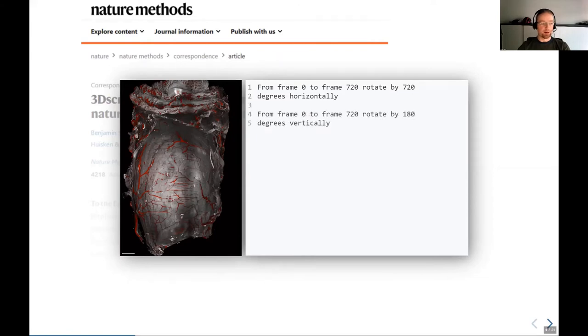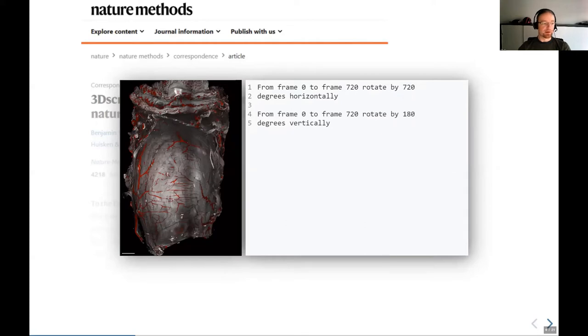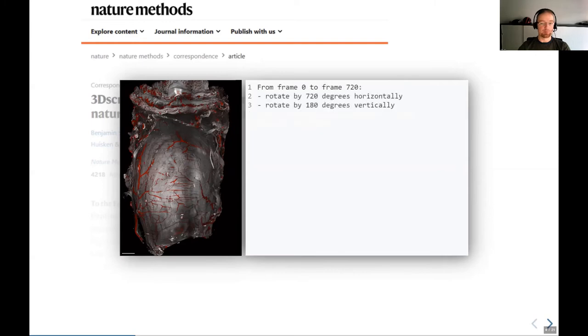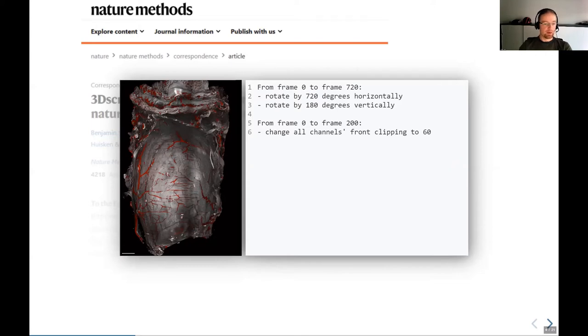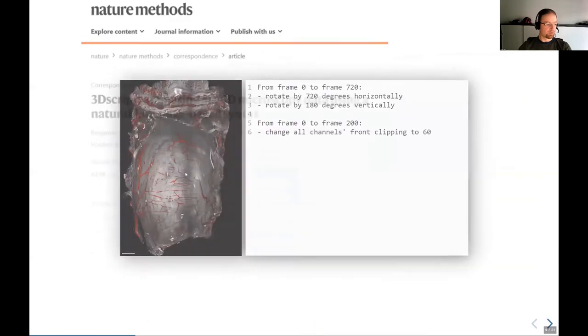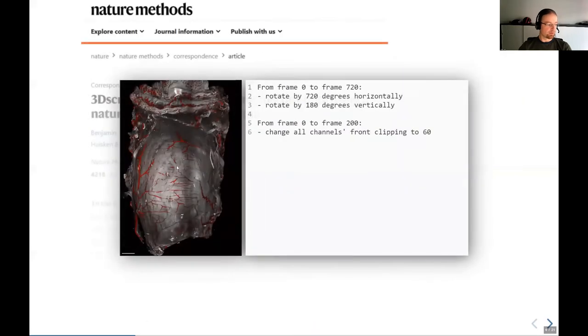Now we can concatenate several of these sentences. If it's like here that they act in the same frame interval, we can also write them more elegantly as enumerations. We can add stuff like here we changed the front clipping plane, which is the plane where the rendering actually starts. Now let's just see what this would look like.